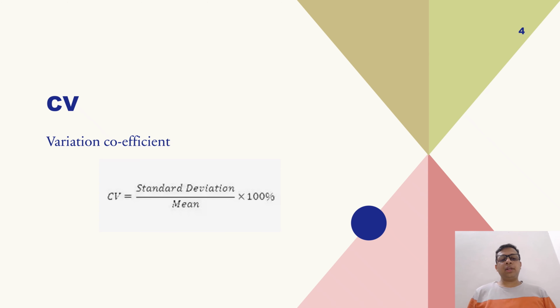So to actually compare these two marks, we have to calculate the percentage. Similarly, SD is like the value or the marks and the CV is like the percentage. So by calculating the CV, you can compare your CV or the quality to other labs and the manufacturer. Now we will see how to calculate it on the Excel sheet.